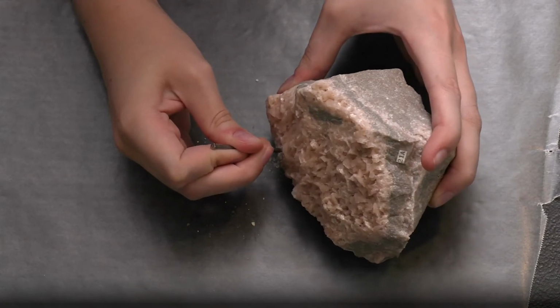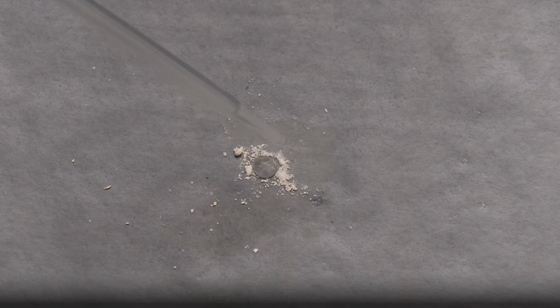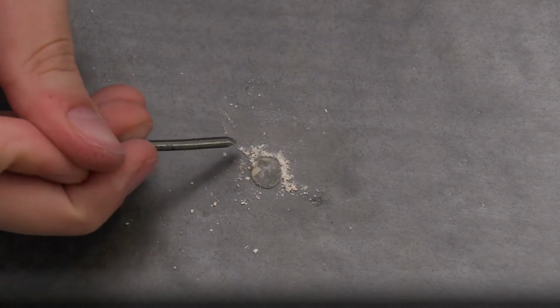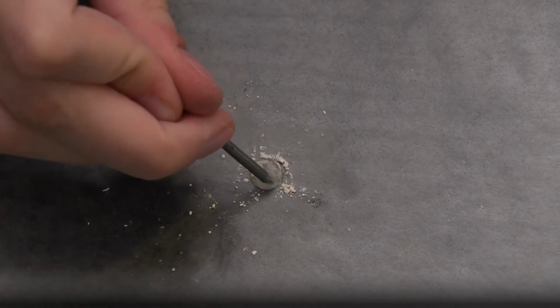To increase the intensity of a reaction, we can either increase the temperature of the hydrochloric acid or increase the surface area for the reaction to take place, or in other words, utilize the powdered form of the mineral in place of its solid form. We can scrape some powder off of this dolomite sample to test with a drop of HCl. The powdered form reacts much easier than the solid form of dolomite.